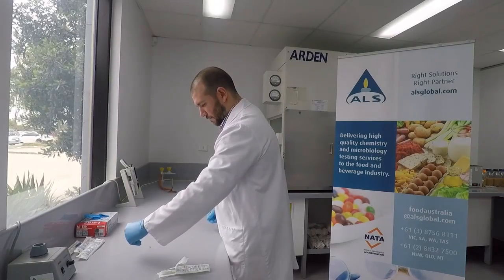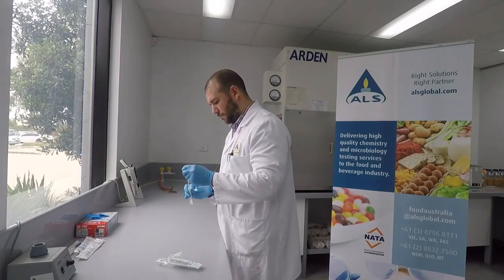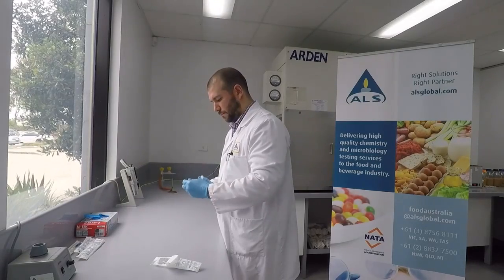Once swabbing is completed, crack the seal on the tube, remove the lid and carefully place the swab stick into the solution. Make sure that the swab stick does not come into contact with any other surface or clothing.